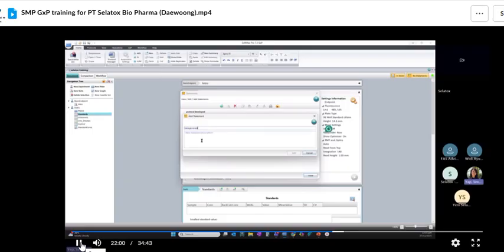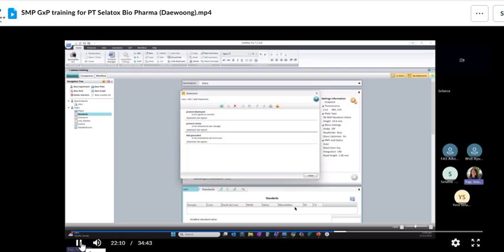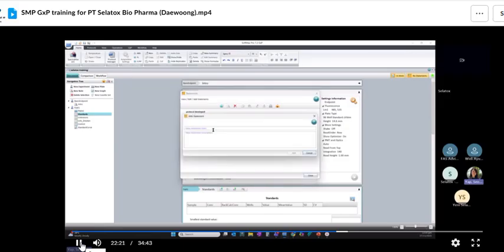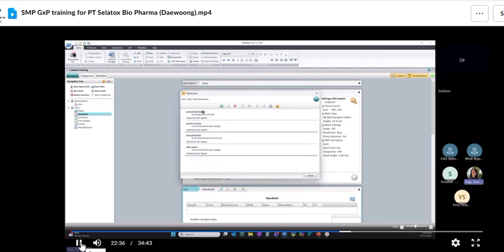Okay, data generated to be reviewed by lab technician. Okay, so this will be this step. Okay, after that will be to ask the lab manager to approve it. Okay, so number 4 statement would be data review. So that will be to be reviewed by lab manager. Okay. So total 4 statements.